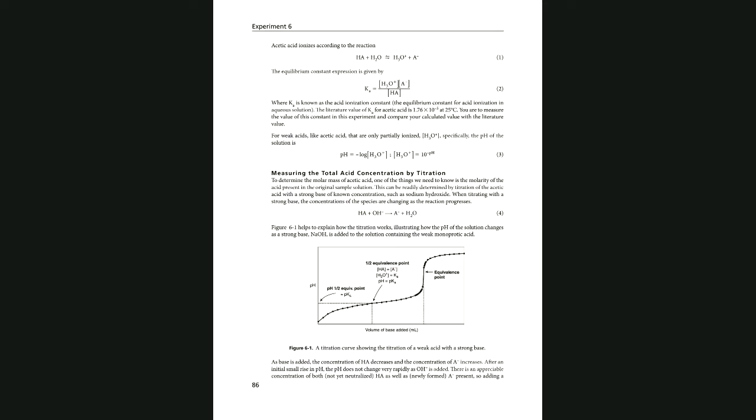And then if you take the anti-log of pKa, you get the Ka value for your acid. So that's what we are trying to do today. Definition for pH, it will be covered in lecture.